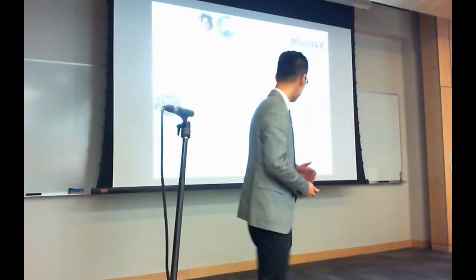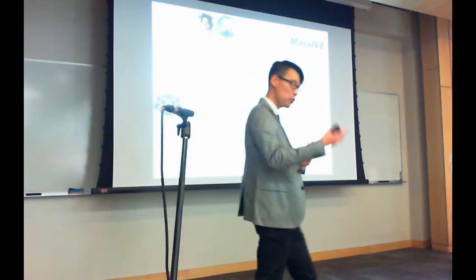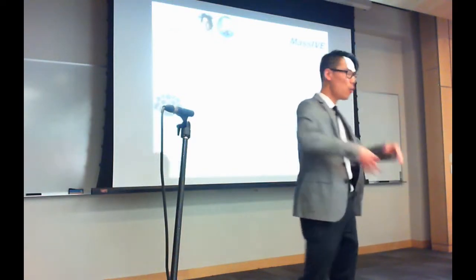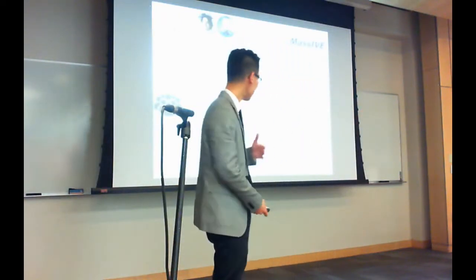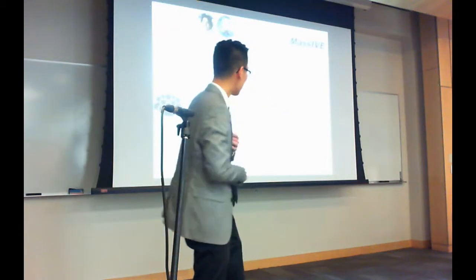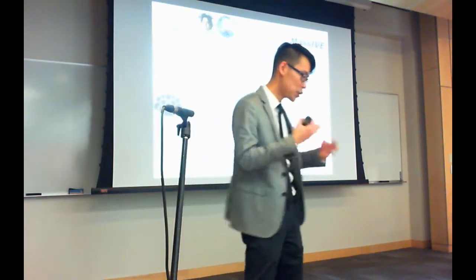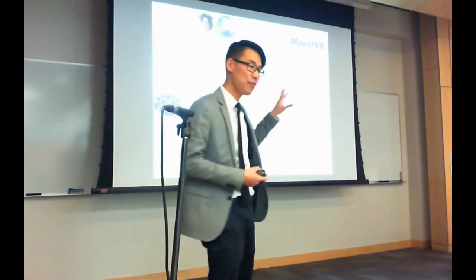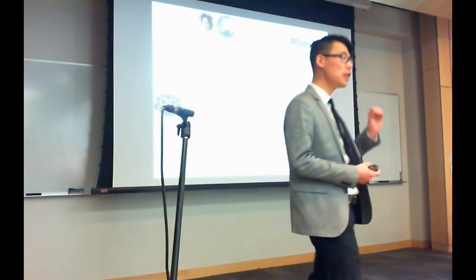And so part of this massive data repository is that users in the community can deposit data. We can pull in data from other repositories. We can convert these proprietary formats to open formats. And we also can do automated reanalysis. Further, we index all these reanalyses for users to actually explore these identifications and reuse the data. And we also have advanced analysis tools to allow the community to really explore the data in depth.